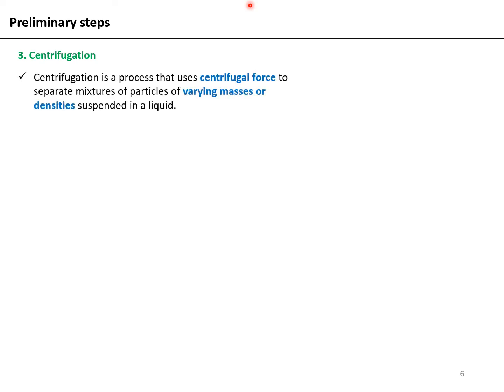So centrifugation is a process that uses centrifugal force to separate mixtures of particles of varying masses or densities suspended in a liquid.